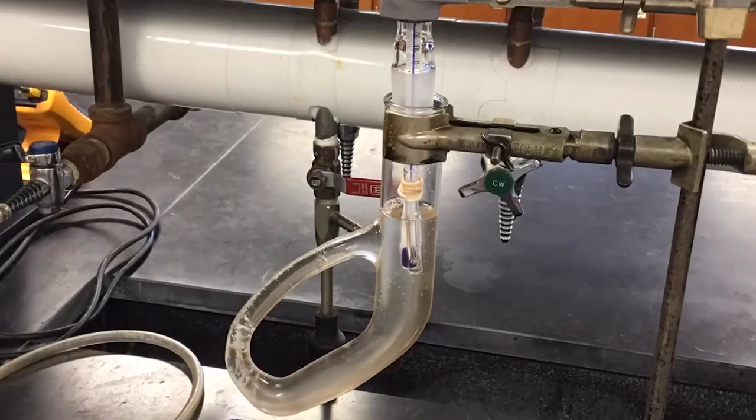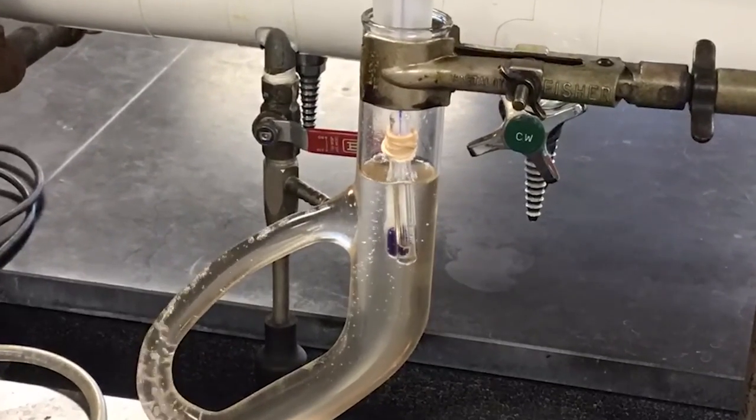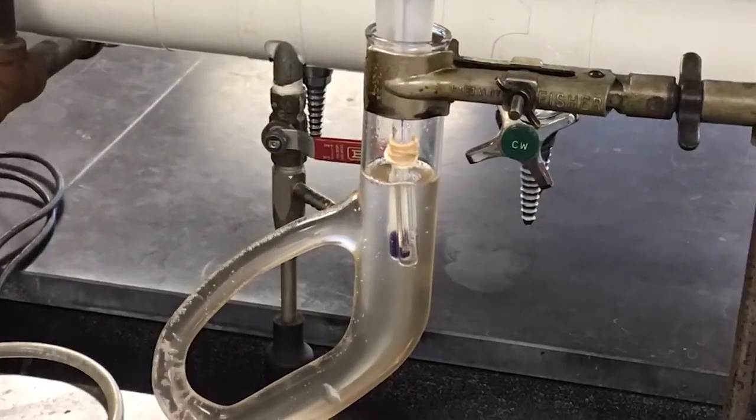It will start bubbling, but when it starts to bubble rapidly, that's when you're close to your boiling point temperature. Once it boils rapidly, turn the flame off.